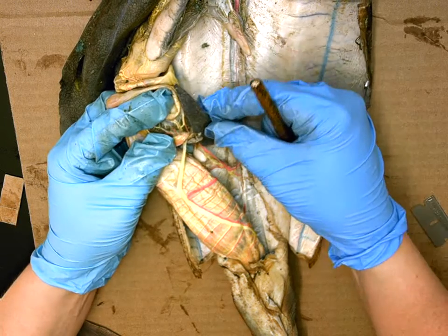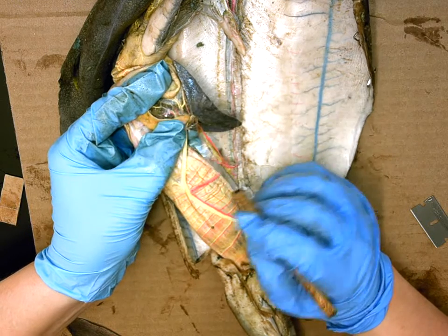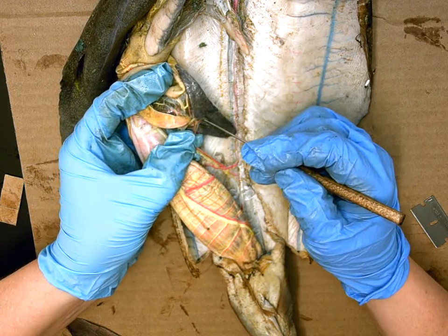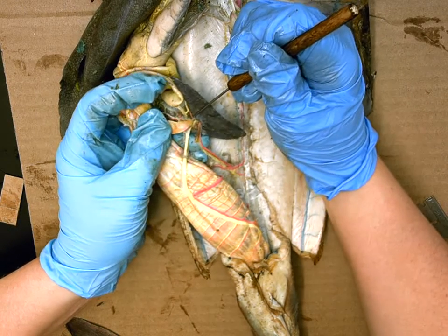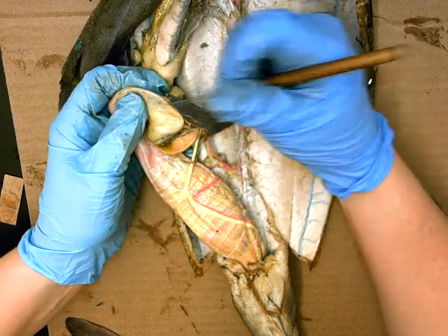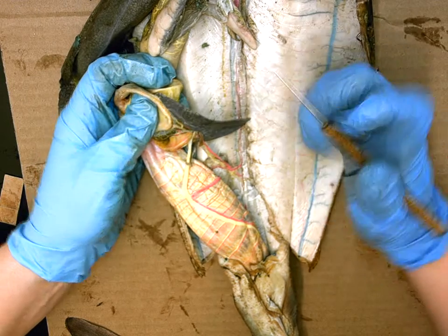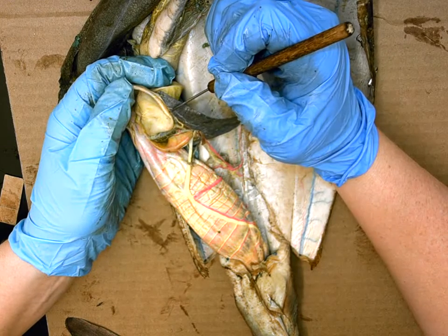The gastrosplenic artery branches further: one pink branch dives directly into the spleen itself and is called the splenic artery. The other pink branch at the bottom of the spleen goes up to feed the underside of the J-shaped stomach and is called the gastric artery. So the gastrosplenic will become either the splenic artery or branch up to the gastric artery at the bottom of the stomach.